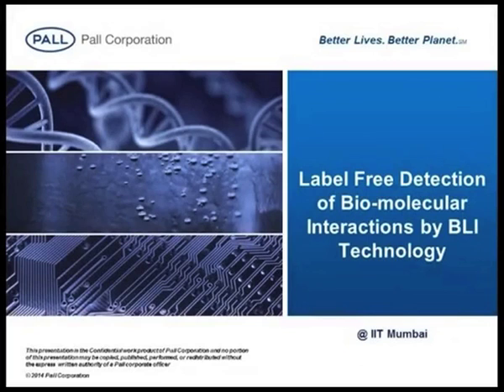As you know, there are detection systems, like in the case of protein estimations or kinetic studies, where you perform ELISAs. Like in ELISA, it is an endpoint detection. You are attaching a kind of a tag to that.